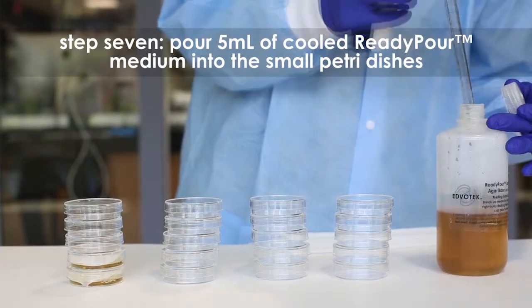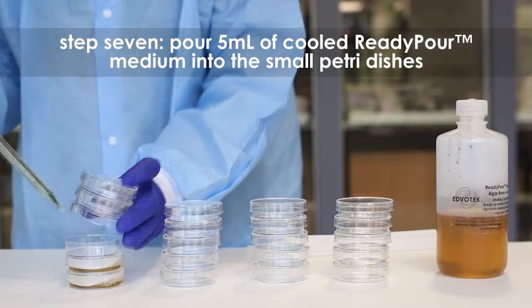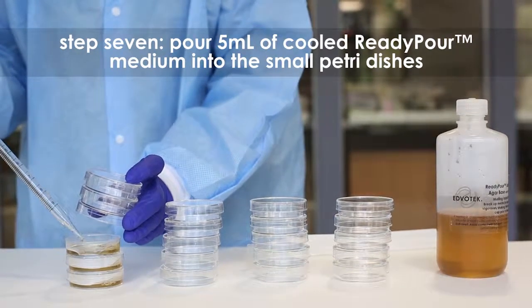Step 7: Using a fresh sterile 10 ml pipette, pour 5 ml of the medium into small petri plates. These are the control plates.